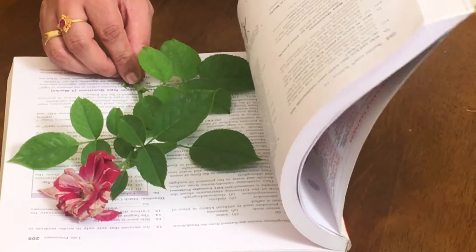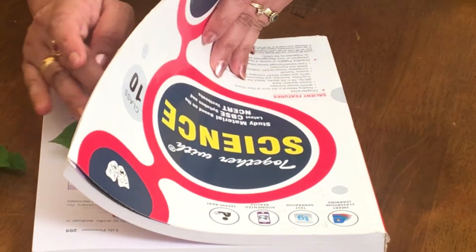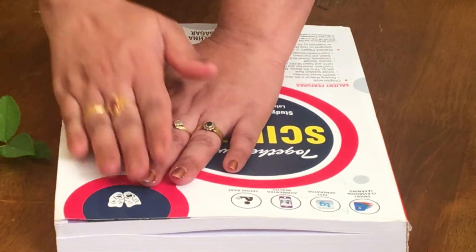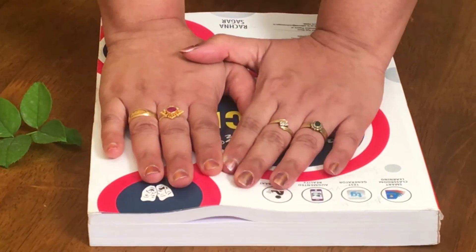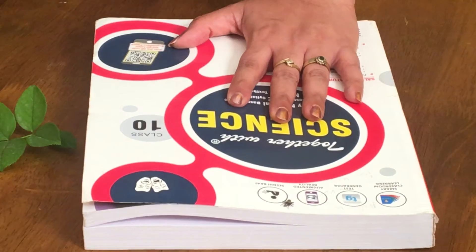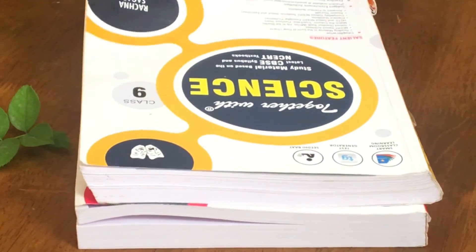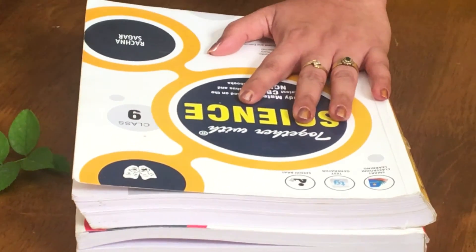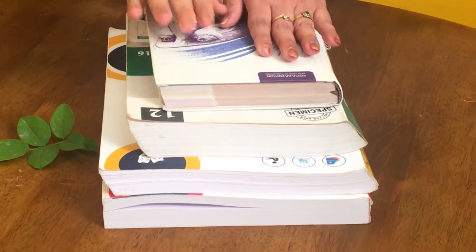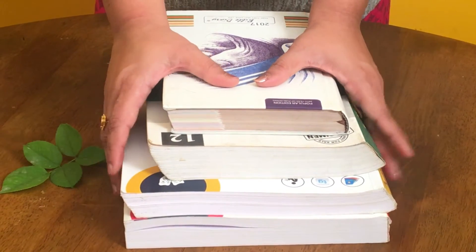Close this book. Be very careful while handling it — it has to be closed and pressed. This has to be kept for at least one week. Take a few more heavy thick books and keep them on top of it. This setup you can keep in a cupboard in a dry place.